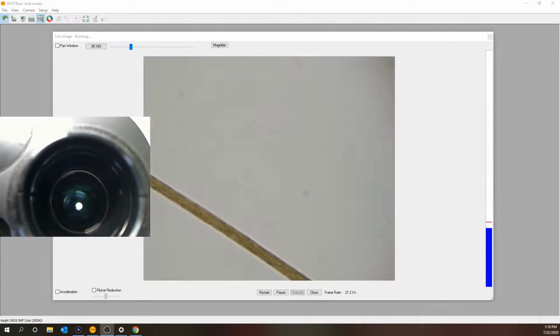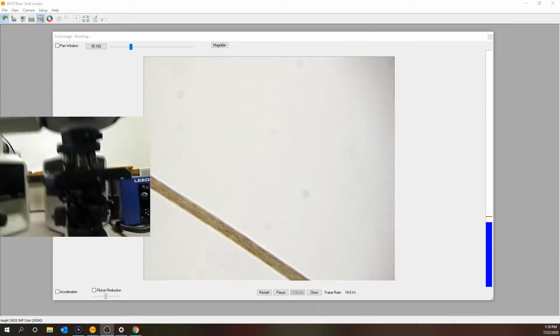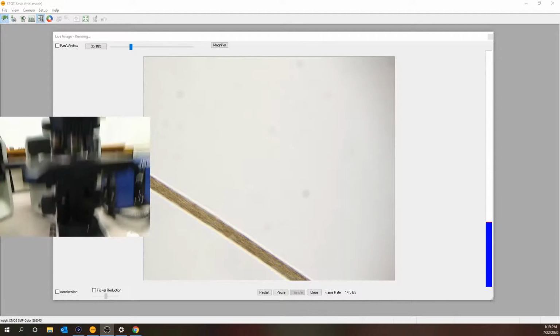And the rule of thumb here is you can close down your aperture so that 75% of the field of view is still illuminated, and you're covering 25% of this intermediate image plane with the aperture. So open up, we're closing it down, stop. And again, it's basically getting us to the same point of trying to find that good balance point between resolution and contrast.